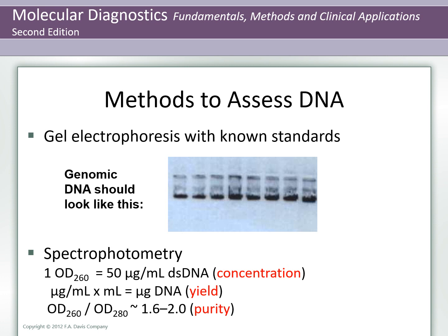When a gel is stained with DNA binding dye, such as ethidium bromide or SYBR Green II, the DNA fragments can be seen as bands, each representing a group of same-sized DNA fragments. Genomic DNA should appear as in the image. It runs as tight smears close to the loading wells.